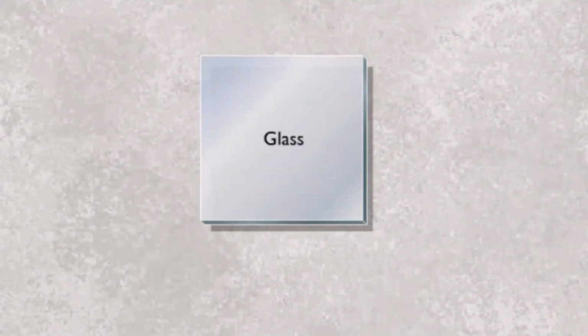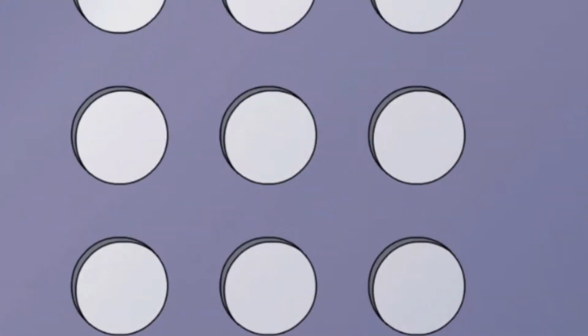There are several ways to make a microarray. The one described here involves methodology adapted from computer chip technology. A piece of glass about 1.5 by 1.5 centimeters is covered with a mask containing holes corresponding to the sites of attachment of the desired nucleotides.